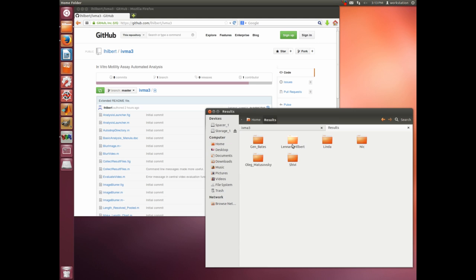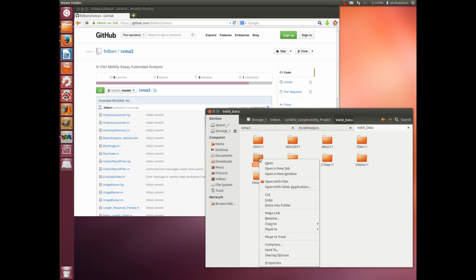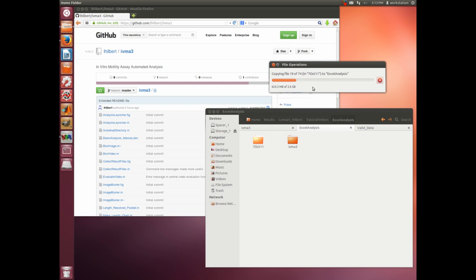So that's here, results, my folder, tutorial videos, and Excel analysis, and we just put them. Didn't copy it yet. Copy and paste. It's going to take a short moment. It's a relatively big file. Transfer this over.